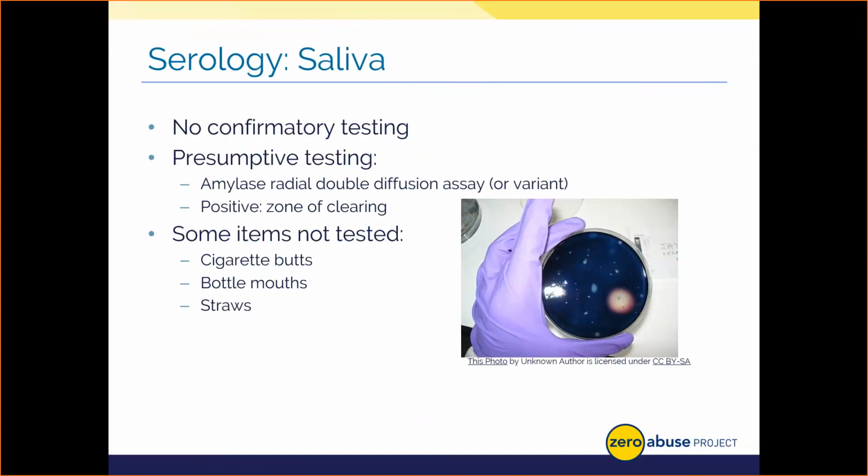In fact, in my graduate research, we attempted to look at molecular markers like DNA or its sister molecule that I referenced earlier, RNA, to confirm body fluids. But we're just not there yet in terms of these novel research methods. But I'm going to argue that one day we'll get there, especially with how fast DNA methodologies are advancing. So how do we presumptively test for saliva then?